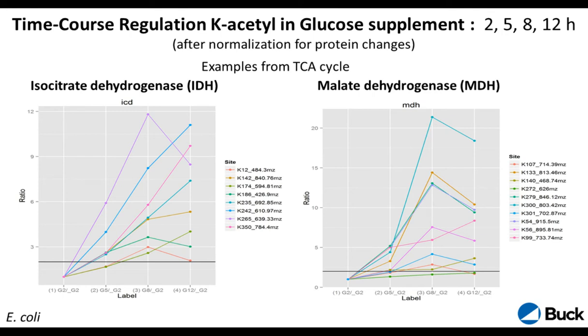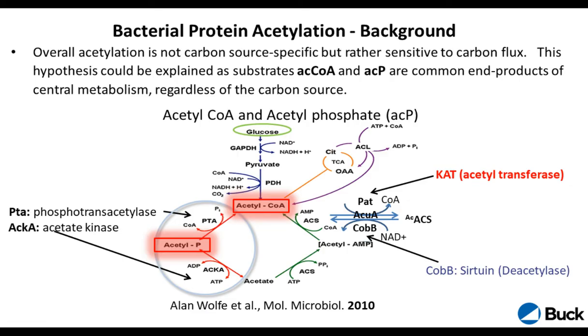But I wanted to show you a couple of different examples, and Matt referred to this earlier. These antibodies work on mouse, they work in bacteria, and here I wanted to show you one slide on how we work a lot on protein acetylation in a bacterial background. It's interesting because in bacteria you have different mechanisms. There's acetyl-CoA, and there's also something called acetyl phosphate, which doesn't exist in higher organisms like mammals.